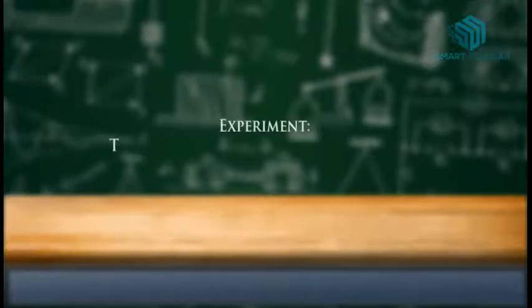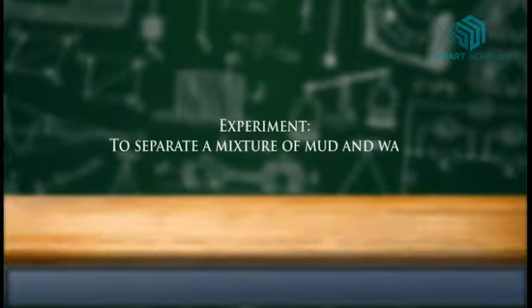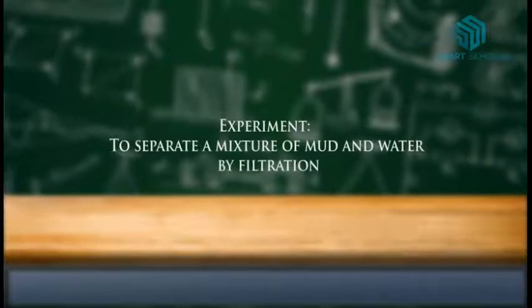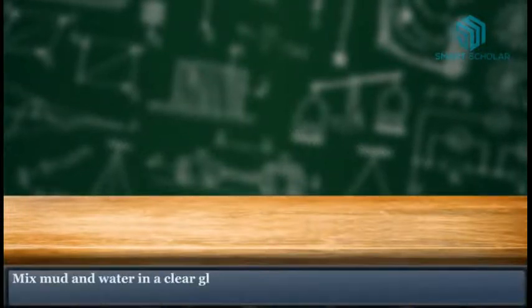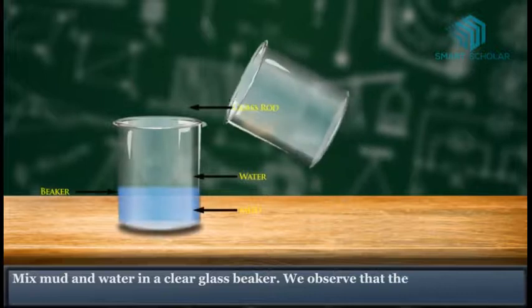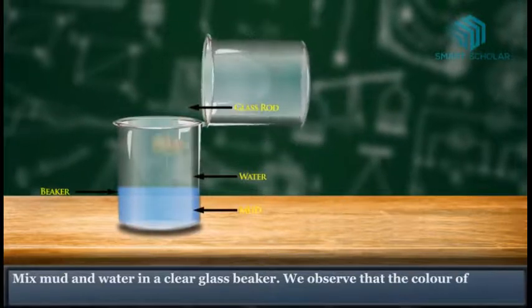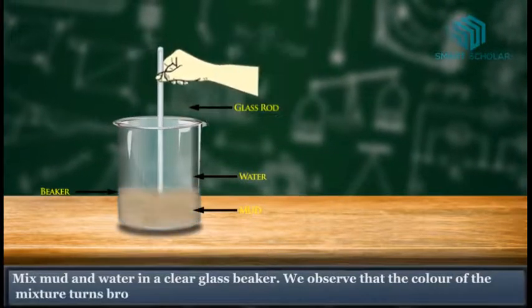Experiment to separate a mixture of mud and water by filtration. Mix mud and water in a clear glass beaker. We observe that the color of the mixture turns brown.